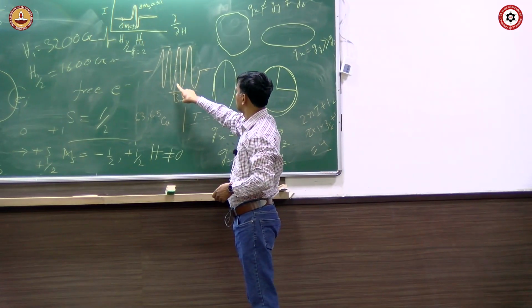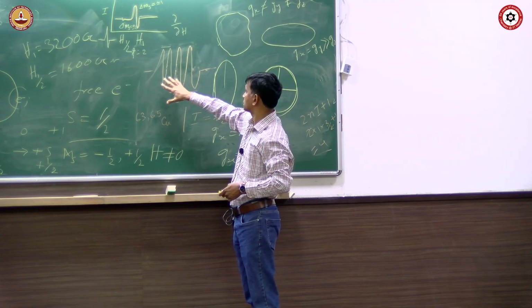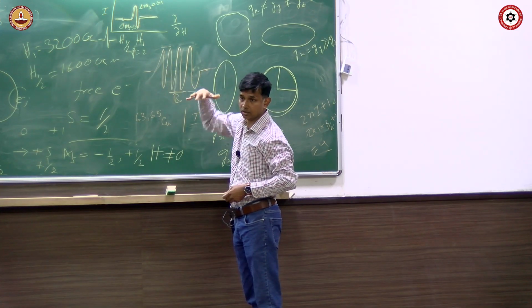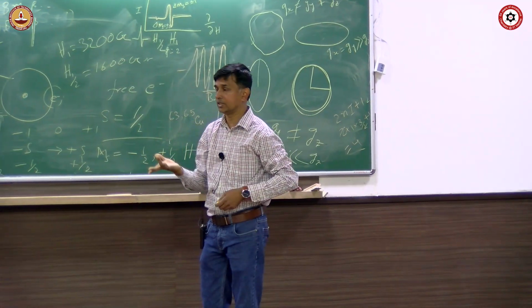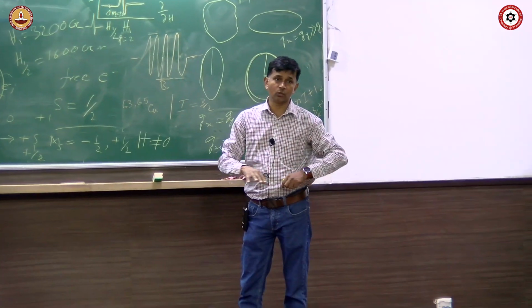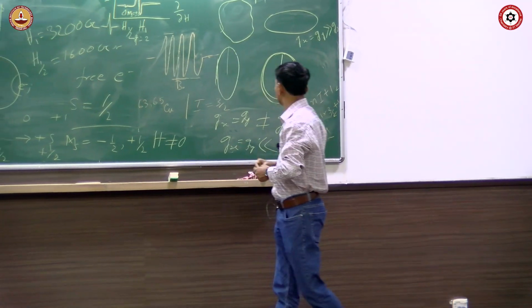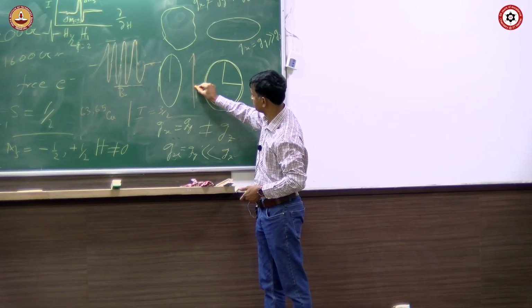And now for the copper ion you will hardly get such a nice symmetrical signal, because the spin density distribution is not actually spherical, it is rhombic or aspherical in some way. So copper has mostly two kinds of signals, one for G parallel and one for G perpendicular. So what is G parallel? G parallel is the one which is along your applied field.